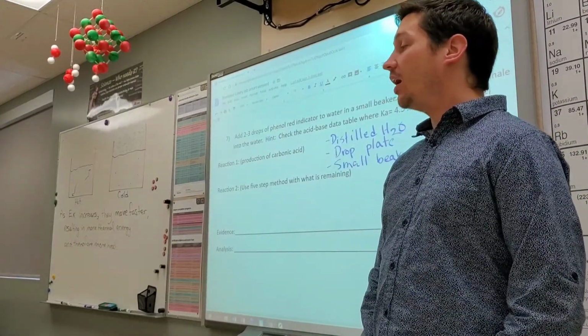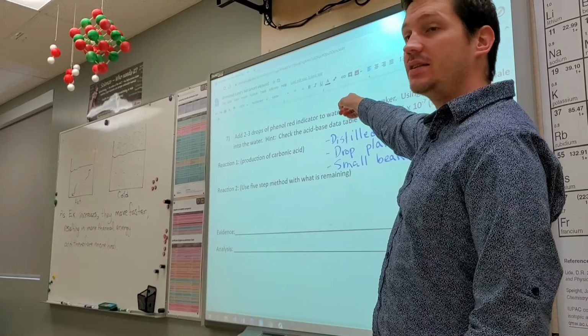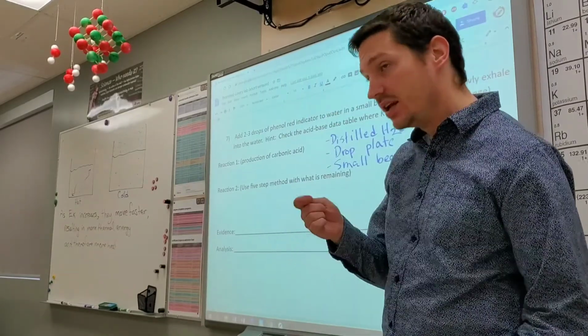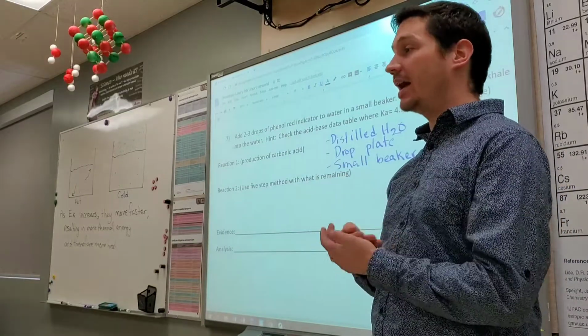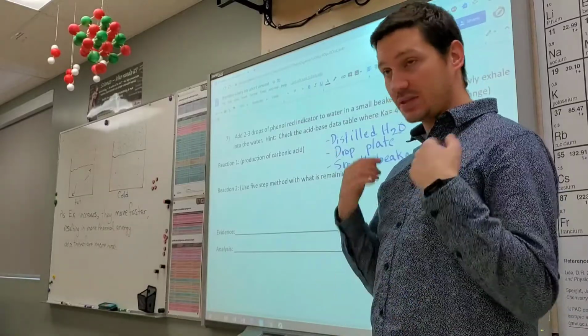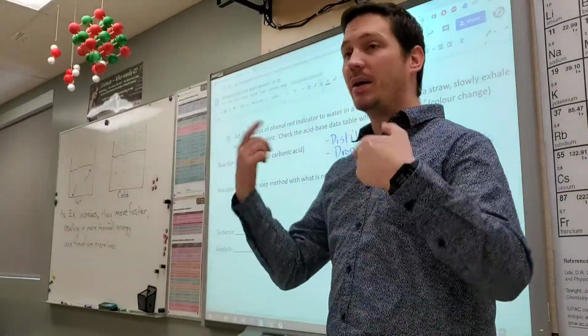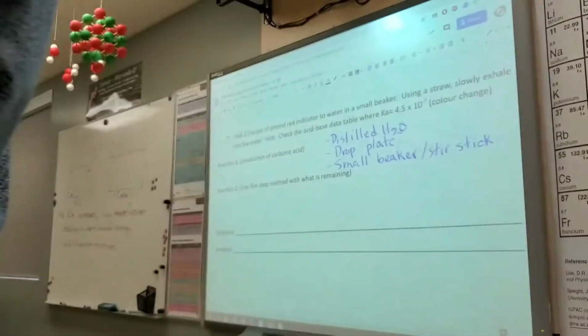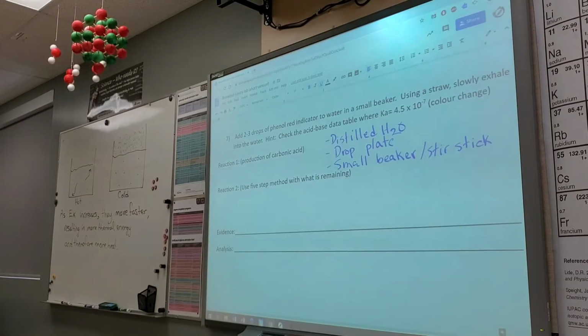Because the aluminum sulfate and the iron 3 sulfate are actually quite dangerous, I want to be very clear. If you get any on your hands, immediately rinse them off and wash them with water. You need aprons, honest to goodness this time, because if you get that powder on your clothes and then spill water on them, they become very corrosive. So you're going to wear an apron, and glasses on your eyes, not on your forehead, the entire time. Are we good? Yes? Okay.